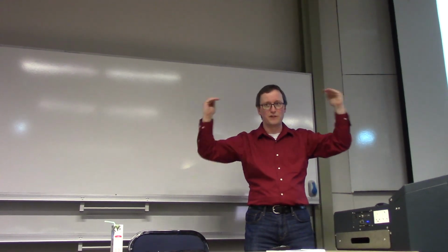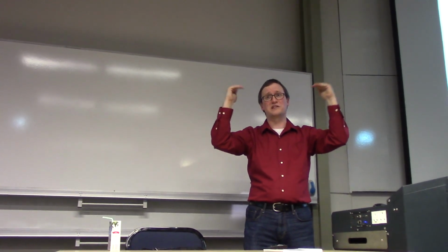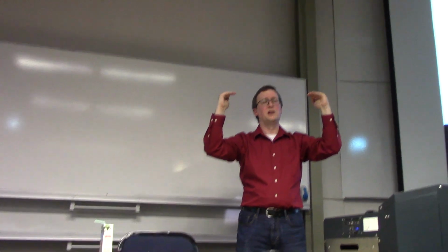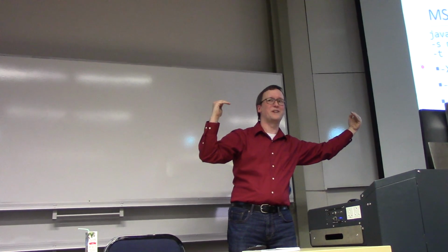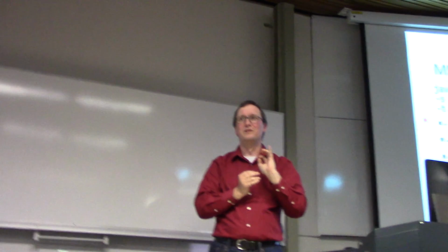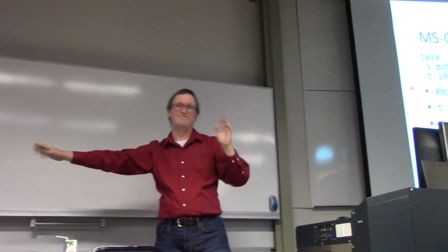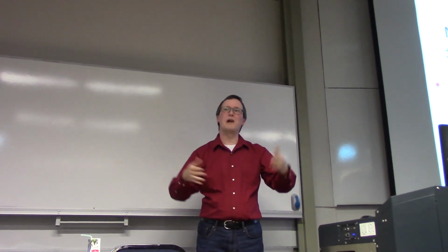So yeah, there's always this push. You want to keep the range of m/z's you're considering overall to be the sweet spot, where all your +2s and +3s probably are. You're not going to be looking for +1s, so there's not a whole lot of value in jumping out to 2,000. But yeah, you've got this multi-parameter fitting problem. You want to be able to sample each chromatogram as frequently as you can, but you also want to be able to discern the fragments of one peptide from one that's completely at a different m/z. So that fitting problem continues to be a big issue.